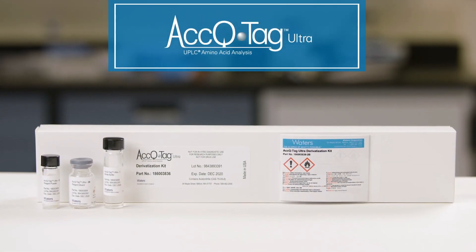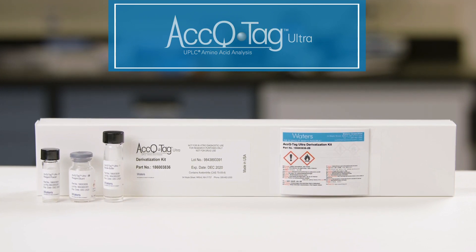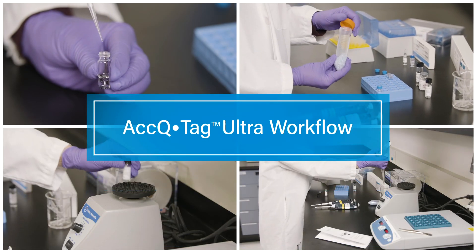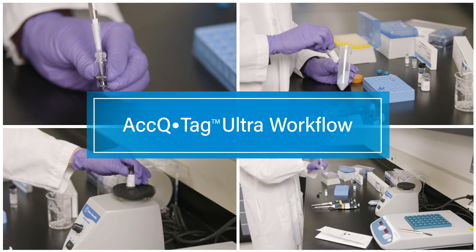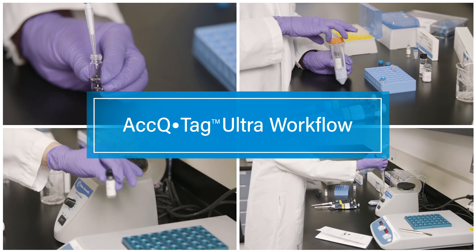Introducing AccuTag Ultra Derivatization Kits from Waters Corporation. AccuTag Ultra Kits are designed for quick, precise, and accurate, qualitative, and quantitative amino acid analysis. Today, we'll go through the AccuTag Ultra workflow. We'll provide step-by-step instructions to better acquaint you with the kit and how to get the most out of your amino acid analysis.